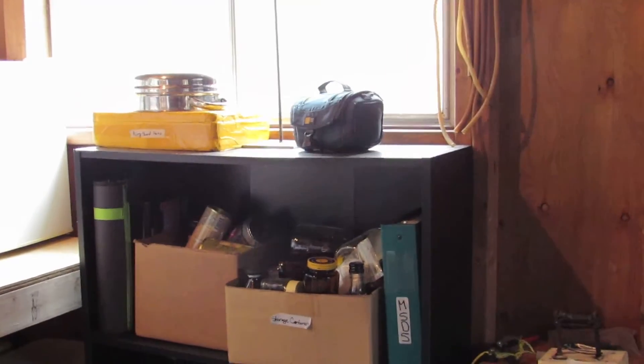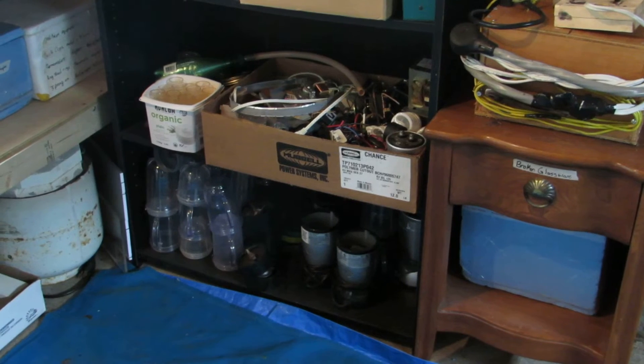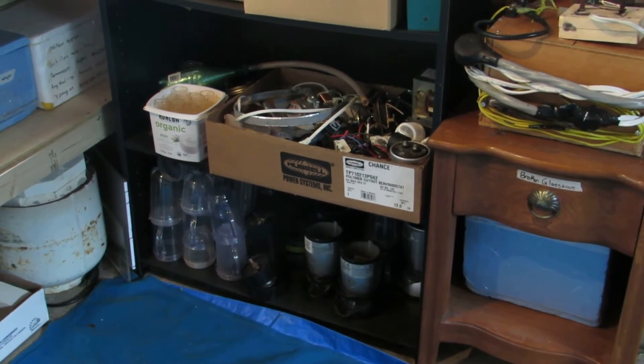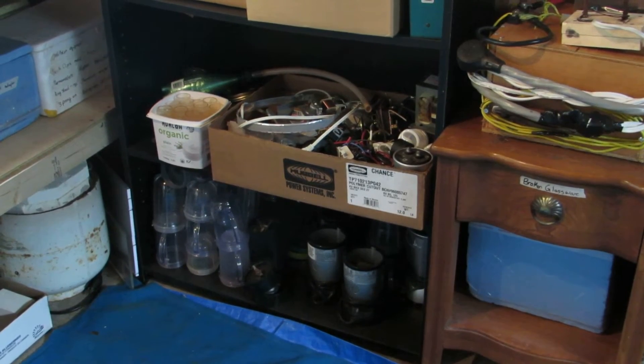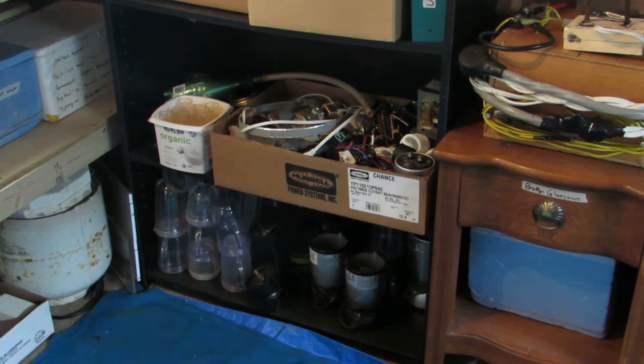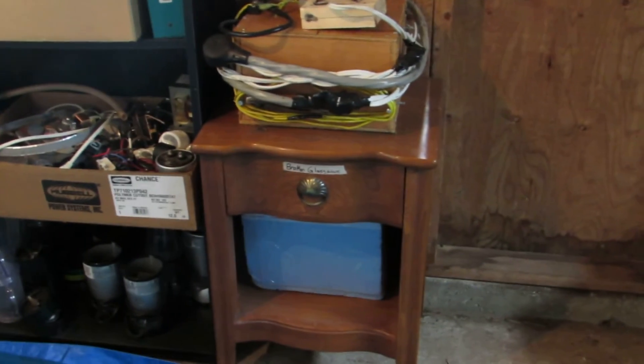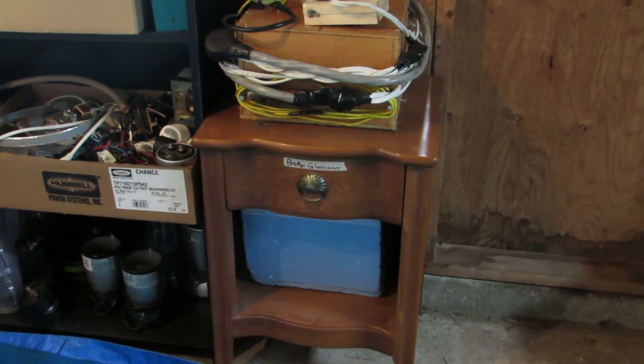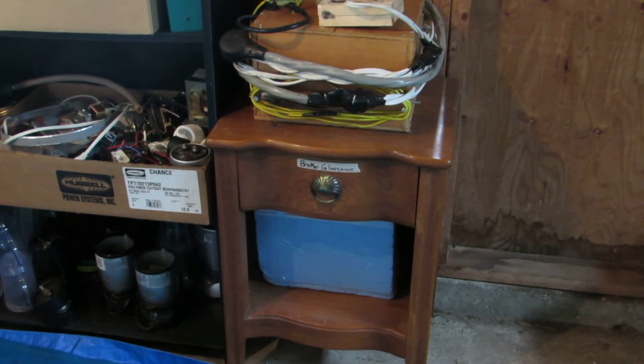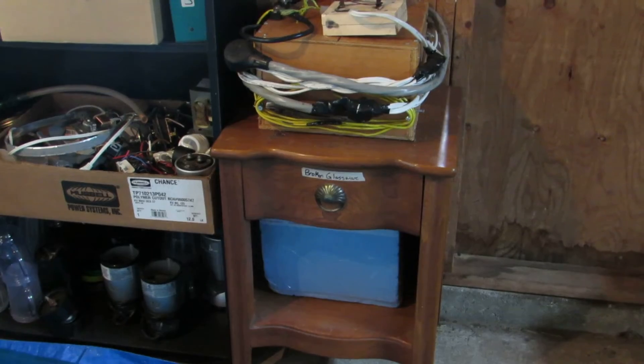So over here I just have some other various storage things, a big box of junk and my magic bullets underneath. And those are just useful for grinding various chemicals. I have like five different magic bullet motors and the blades and then a whole bunch of different jars. In there I have all the broken glass that I've ever broken. I just leave it in there. I don't really have another place for it but that's where it's always ended up.